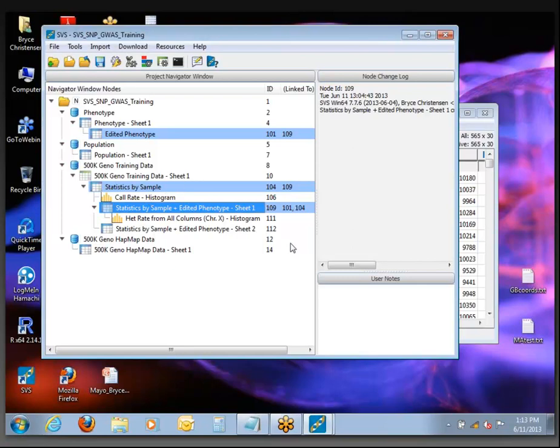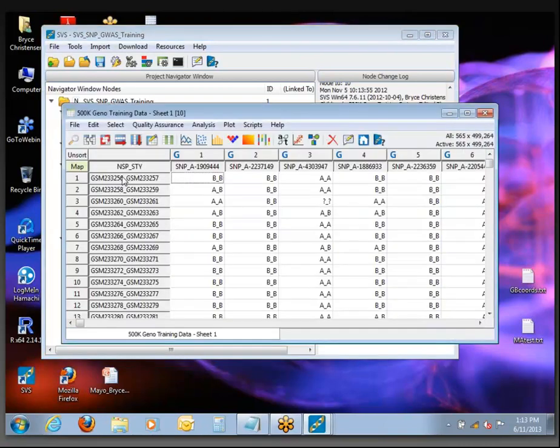Let's open up the genotype spreadsheet again. The first thing we want to do is reduce this to everything but the X chromosome.